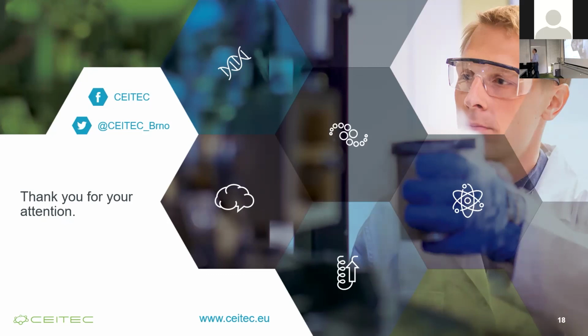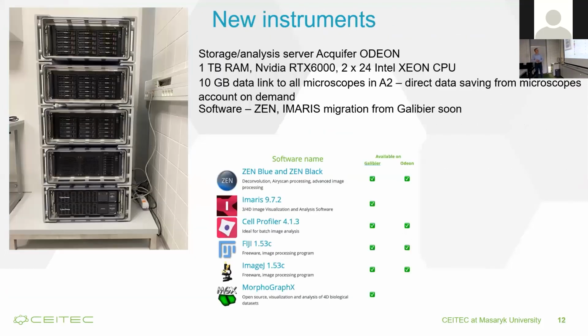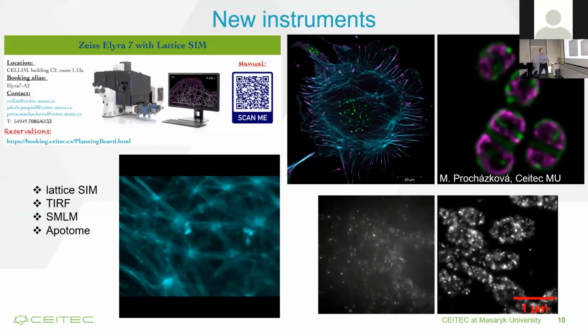But with a normal fibroblast cell, you can go. I have the standard here. This is the human fibroblast, so there's no problem. They are very flat cells, so of course it's maybe 5 micrometers or something. No problem.